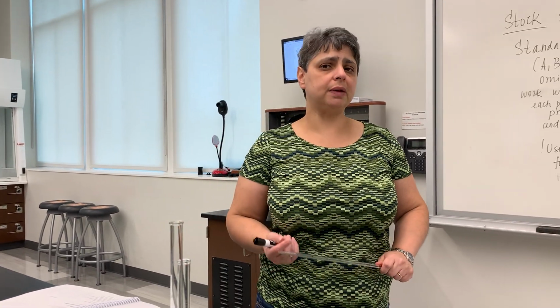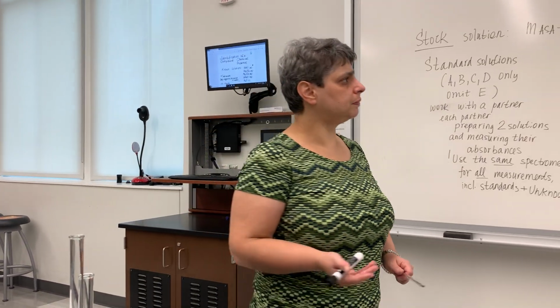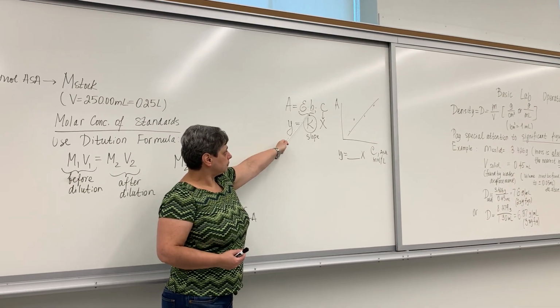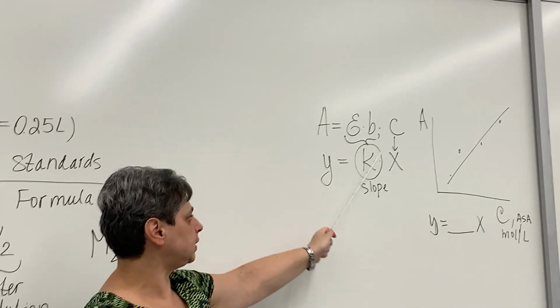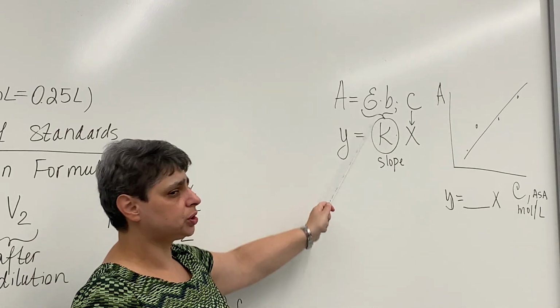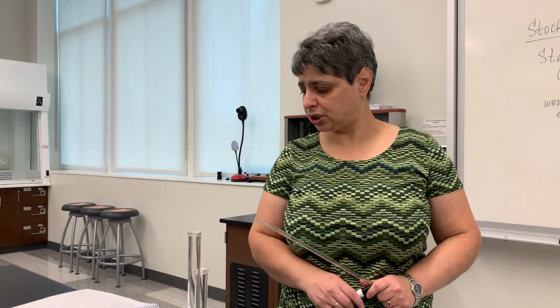And then underneath it says molar absorptivity. I hope I was able to get my point across, talking about it quite a bit in the previous video as well as in this one, because the path length of light is fixed at 1 centimeter because of the width of our cuvette. The slope is equal to epsilon. In other words, molar absorptivity and slope are numerically equal, so you will enter the same value for molar absorptivity as you entered for slope. And please pay close attention to units. Remember, molar absorptivity does have units shown here on your data sheet 1.